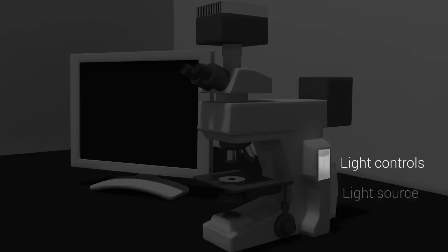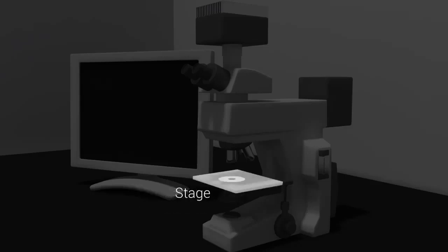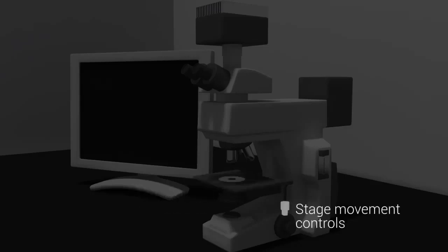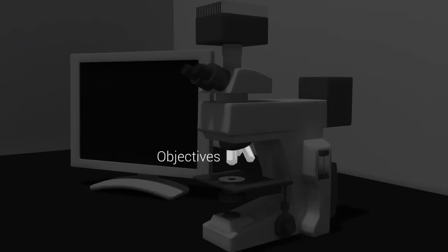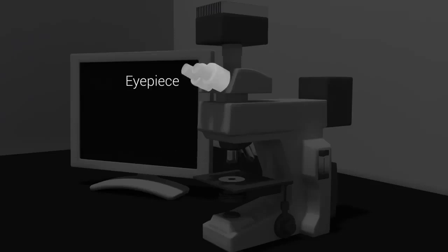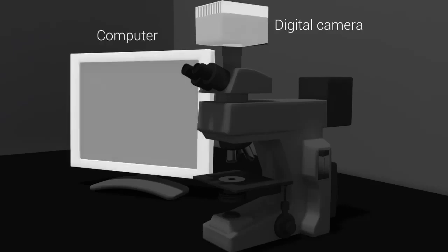All light microscopes have several components, including a light source such as a halogen light bulb or laser, a light source on-off switch with a knob to adjust its intensity, a diaphragm and condenser to focus the light onto the sample, a stage to hold the sample, controls to move the stage, focus knobs for coarse and fine focus adjustment, objectives to magnify the sample, and an eyepiece through which the researcher can view the sample.